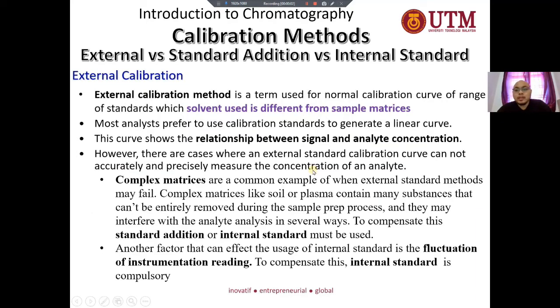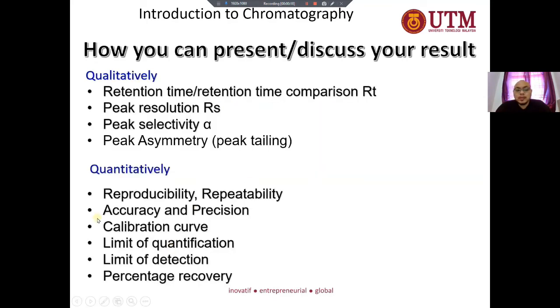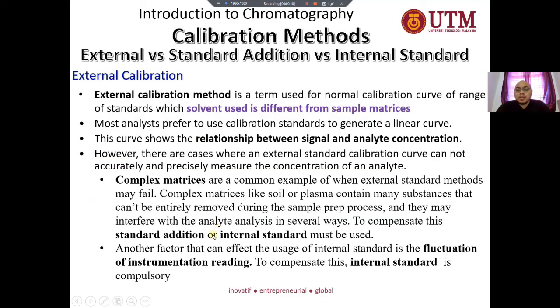Okay, hi everybody, good morning. Now we will continue on the part of calibration methods, which have already been described in this slide. The calibration method is what we need to do to perform any quantitative analysis. Without calibration methods, our quantitative analysis will not be able to be performed or will not be accurate. So the calibration method is very important in every instrumentation analysis. That's why in this study, we will learn in detail how to perform the calibration methods.